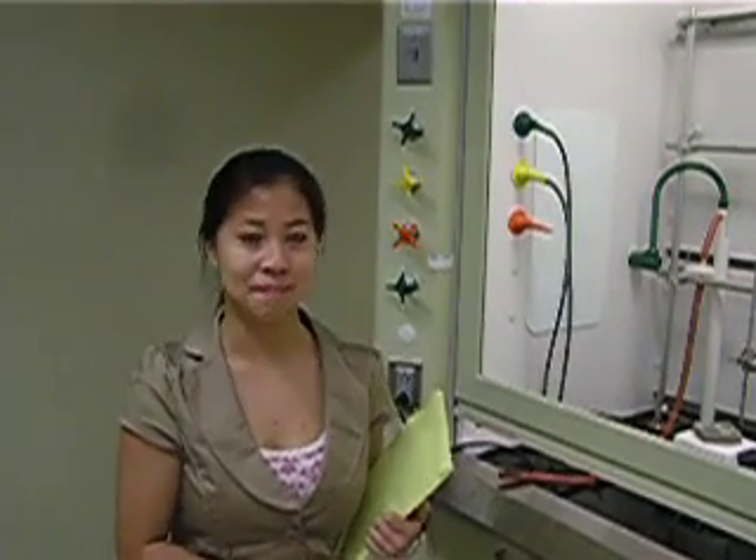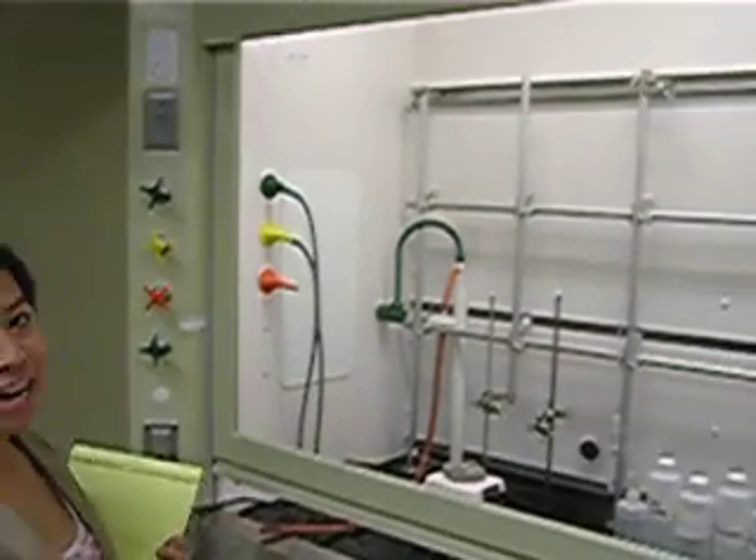Today we'll be taking a general survey of the organic chemistry lab. We're going to start at the student work area.